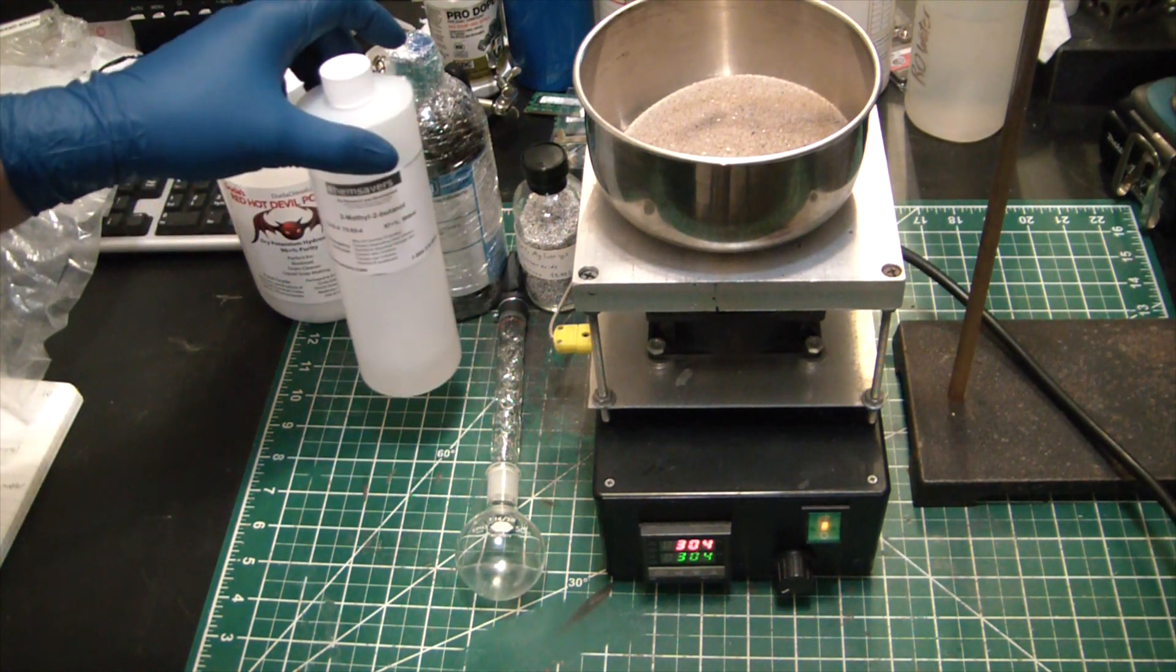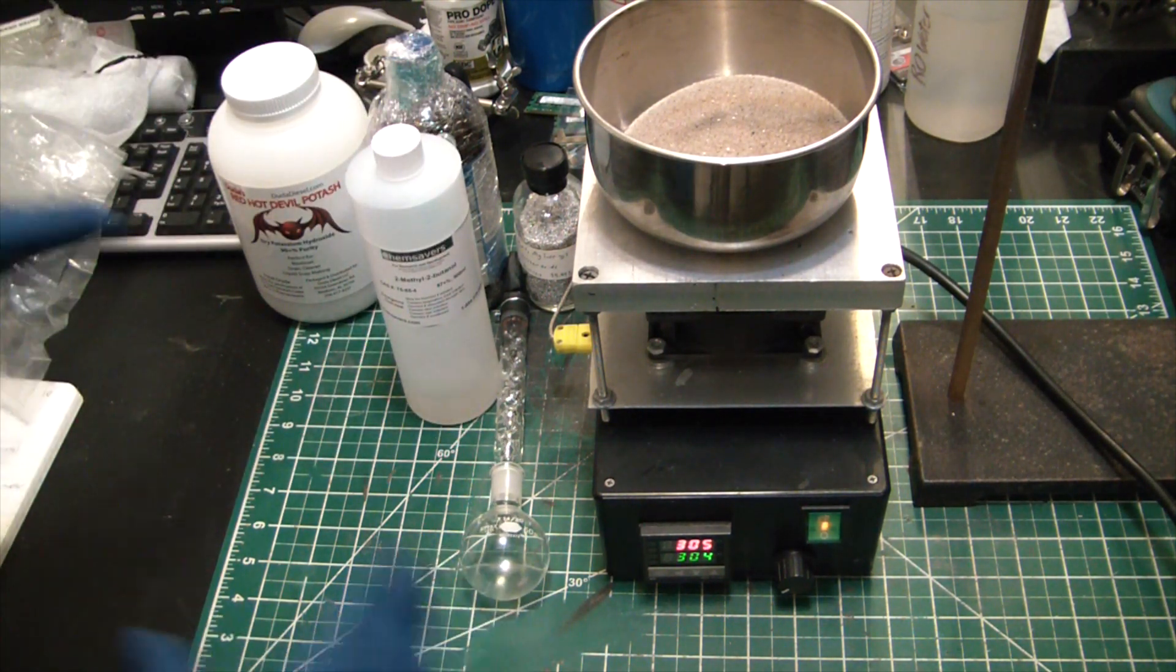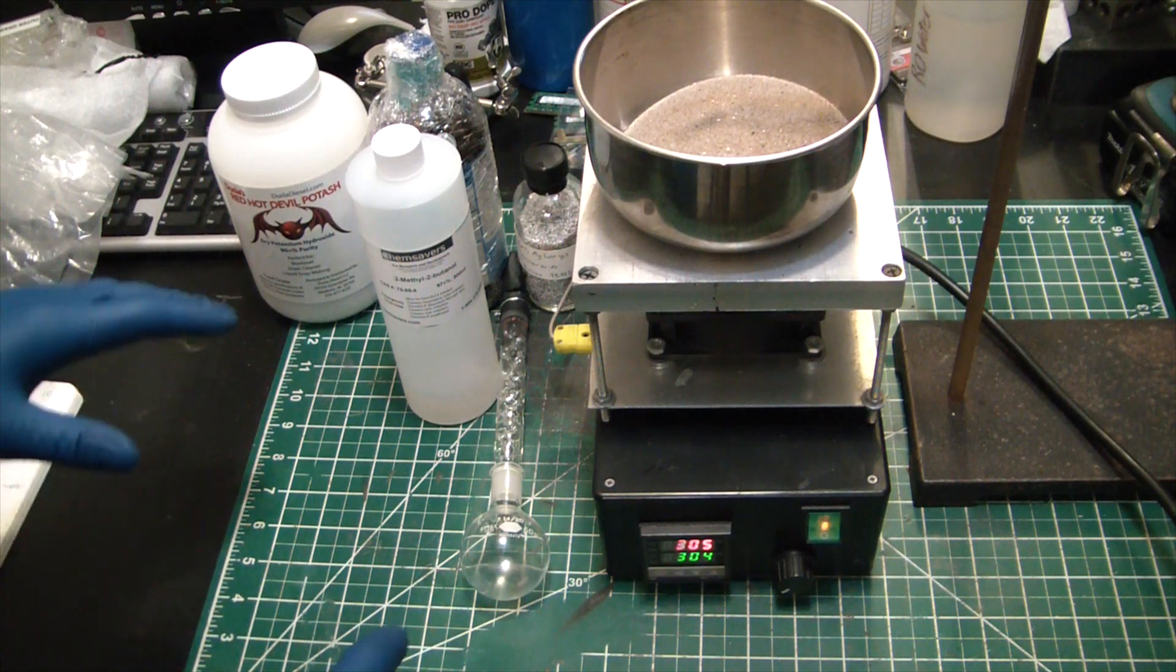2-methyl-2-butanol also called t-amyl alcohol. And we're just going to use 0.8 milliliters of the stuff, so you don't need much. And I'm also doing a very very small reaction compared to what NerdRage does.